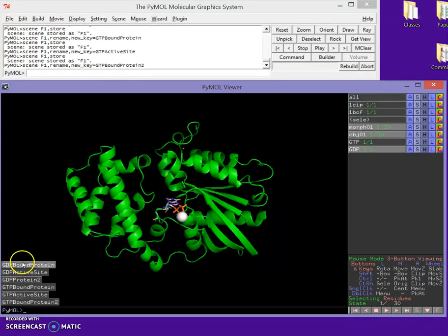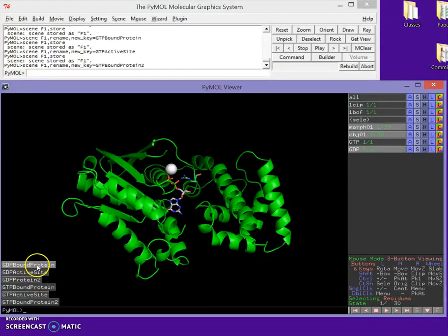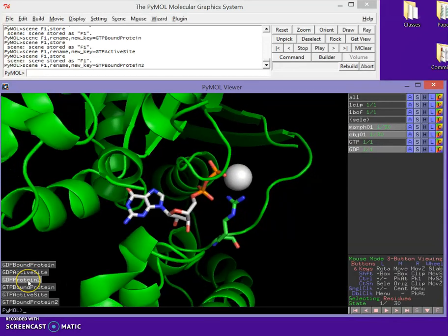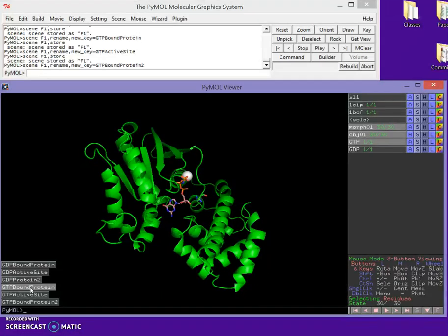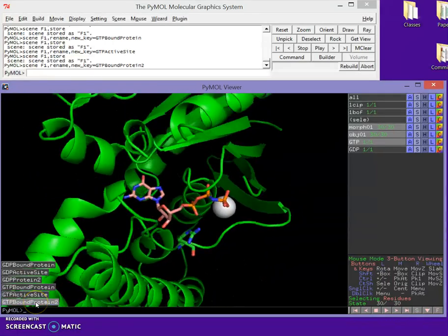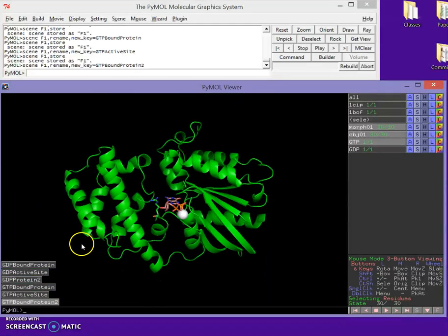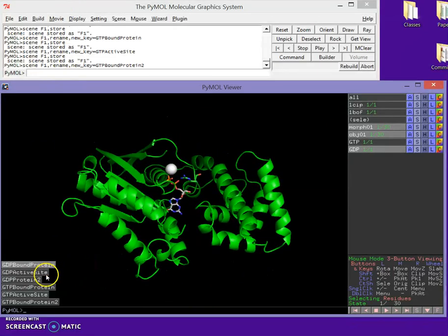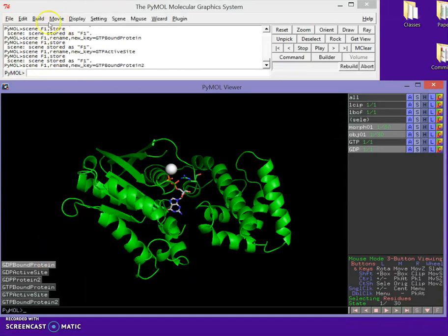Now I have all the scenes I want. Clicking through them: GDP bound protein with GDP turned on, GDP active site zoomed in, GDP protein 2 zoomed back out, then GTP bound protein showing the structural change, GTP active site zoomed in on the active site, and GTP bound protein 2 zoomed back out. Now we want to start programming the movie — we want a little spin to show the protein from all around.